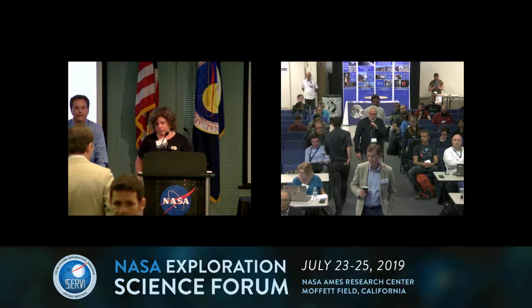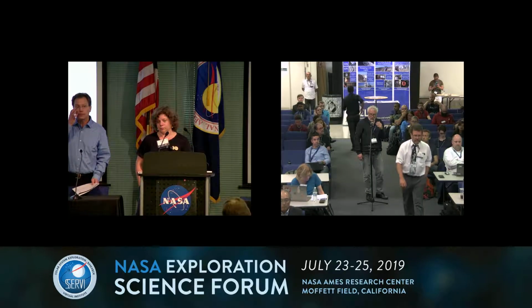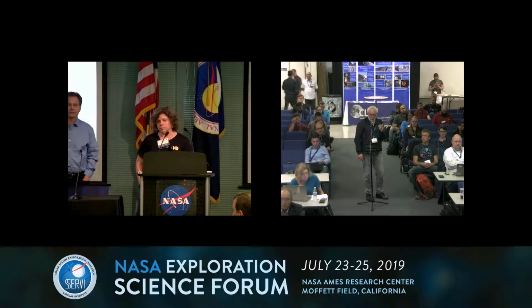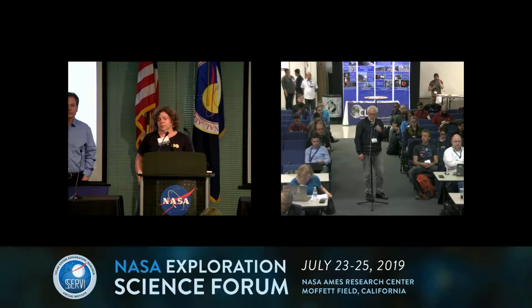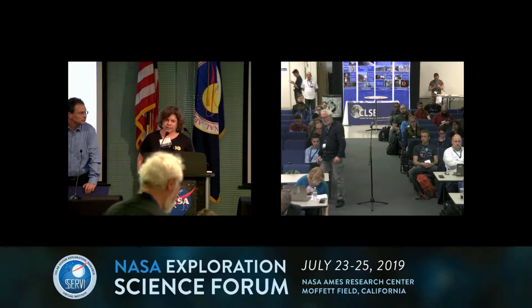So I have a related question. There are soft ionization techniques that are available so that you can actually get the molecular information rather than the high energy electron impact. So is Mady or somebody going to use some soft ionization so that you can get more information than just the simple volatiles that are there? I wish I knew more about Medy's instrument so I could tell you that, but I don't know the answer. Sorry.